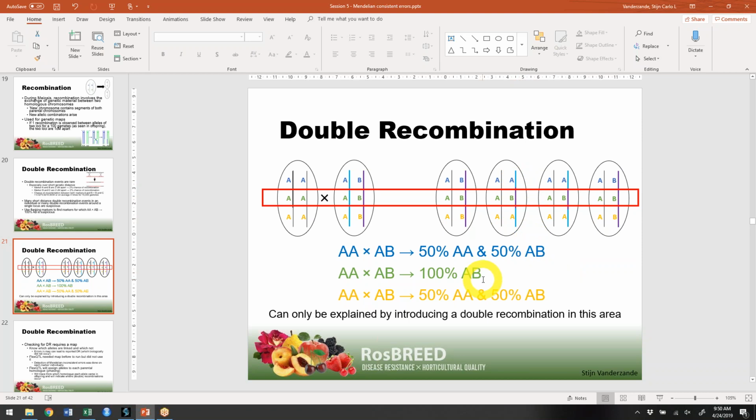And so you can see that these segregation distortions here, if it's happening to linked markers, will force a double recombination, because to get to this, you need to get from blue, recombine to purple, and recombine again to blue. So markers that are not truly having a segregation distortion, but just incorrect calls, lead to double recombinations, and that's what FlexQTL is detecting. So that's what we'll be using to look at suspicious markers.